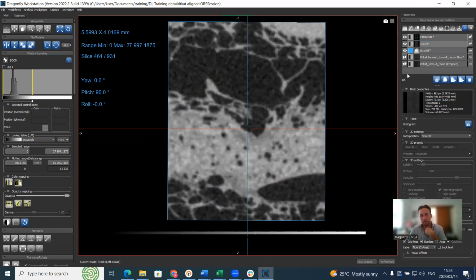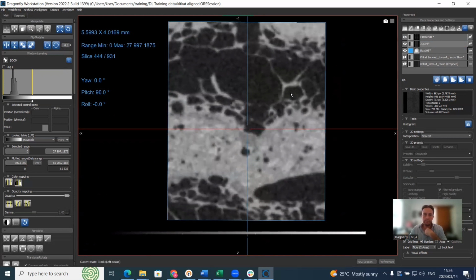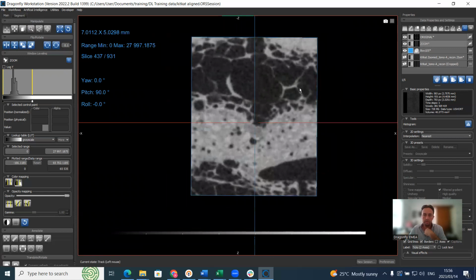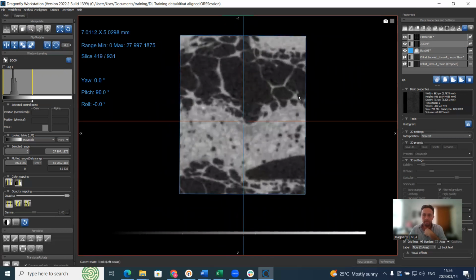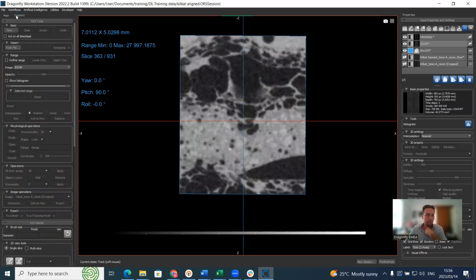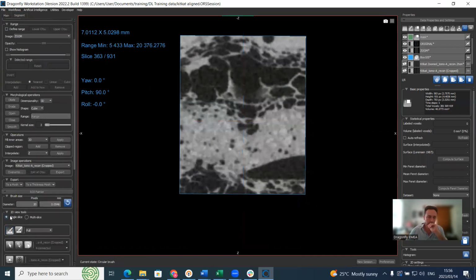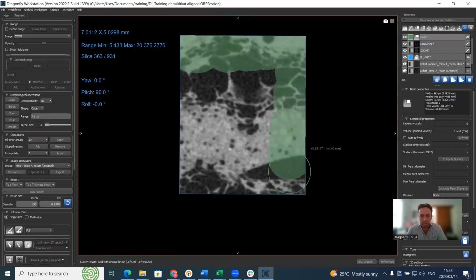And what we also need, because we use the deep learning tool, is a mask and a monitoring frame. So you could go as before, go to segment, make a new thing called mask. And we're going to paint a couple of single slices in the original scan, but it's actually just a mask of the same pixel size and width.